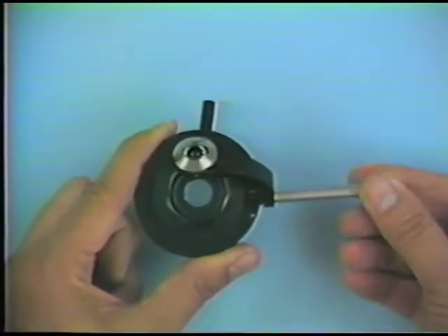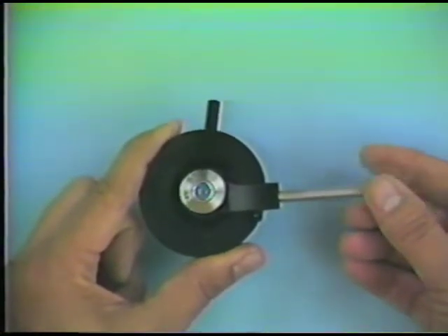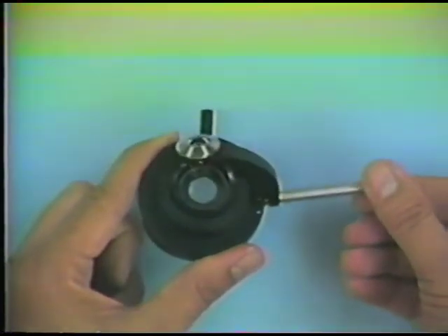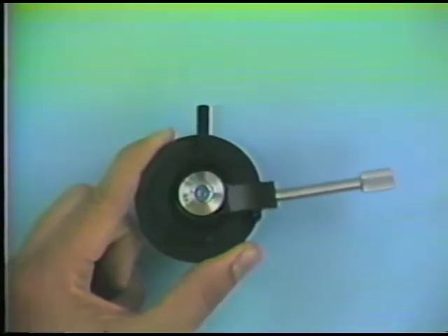Here the light goes straight through the specimen, here the light goes through the specimen at many different angles. So this is the substage assembly consisting of a diaphragm and a converging lens, and fits below the microscope stage.